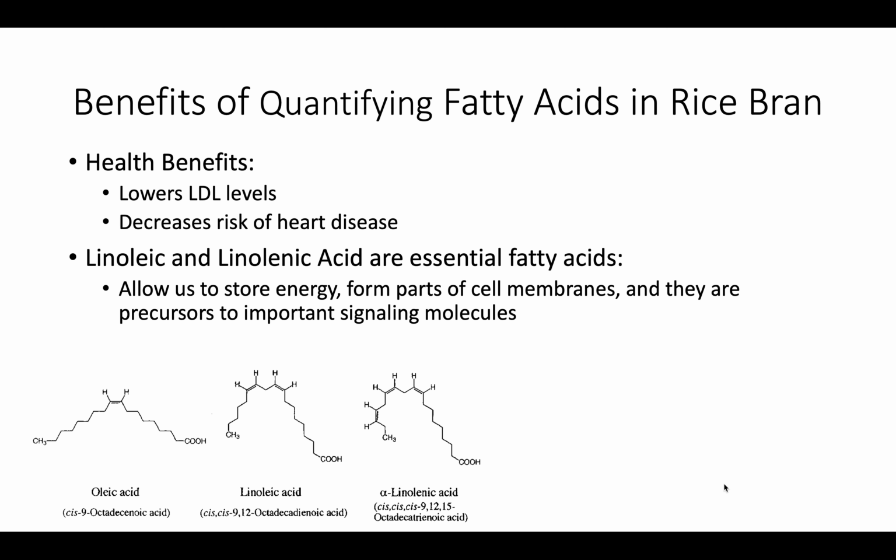To conclude, we are performing this research to create a thorough procedure that can determine which fatty acids are present in rice bran oil so that it can then be determined which rice bran oil is the most beneficial to overall health.